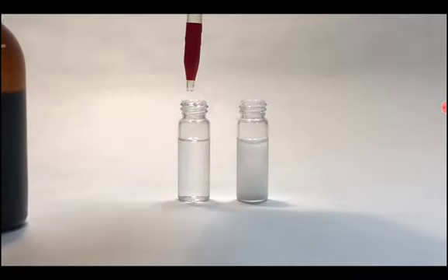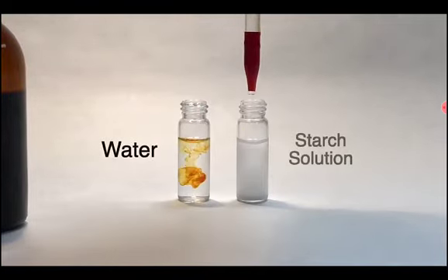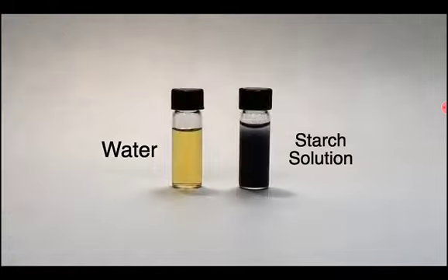For this demonstration, I have two vials. The one on the left is pure water, and the other is a starch solution. A single drop of the iodine test solution is added to each. The vial on the left turns a yellow-orange color, and the one containing starch turns a black-blue color.